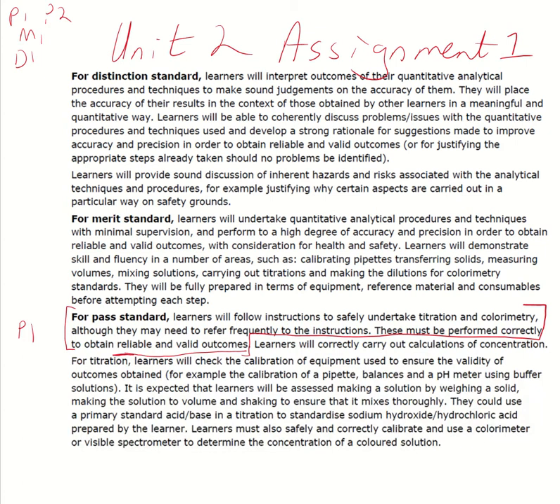So there will be a little bit of calculation involved within that, but generally you should be making up your solution for the titration plus colorimetry.